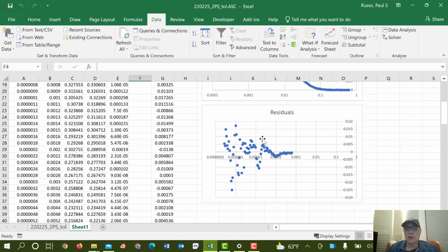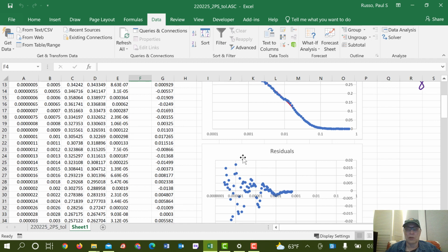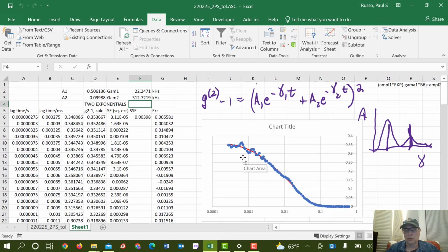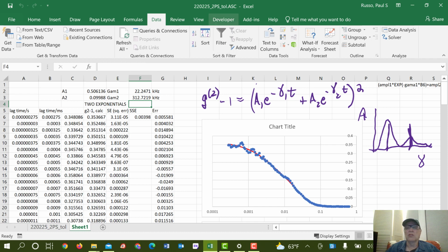And you would know if you tried a single exponential fit that it isn't working, and you would set a double exponential fit. And if you wanted to see what a triple exponential fit is, I think you'd find that you do not dramatically make any improvements that you could rely on in this case. So that's that. Thank you.